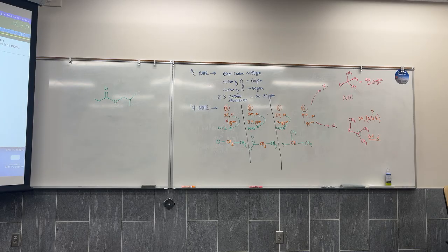Oh, I found it. I missed a CH2 group. So where we see 1H, it should actually be 3H. So look at this, around 1.5, I have 2 signals, 1.7 and 1.5, and they're overlapped with each other. One of them comes from C. C is the CH. And one of them comes from D. D is the neighboring 2H.